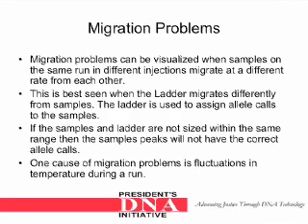Migration problems can be visualized when samples on the same run in different injections migrate at a different rate from each other. This is best seen when the ladder migrates differently from the samples. The ladder is used to assign allele calls to the samples. If the samples and ladder are not sized within the same range, then the sample peaks will not have the correct allele calls. One cause of migration problems is fluctuations in temperature during a run.